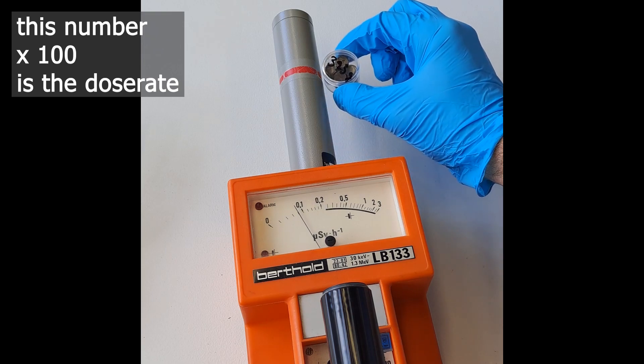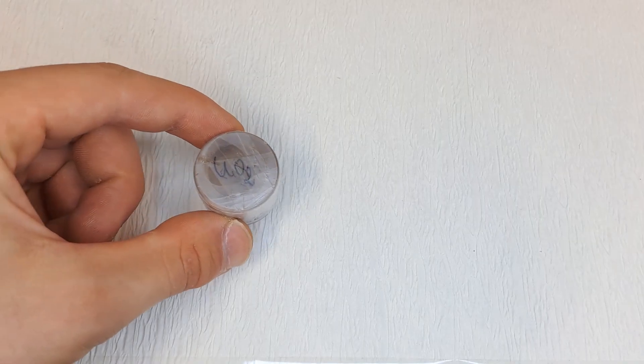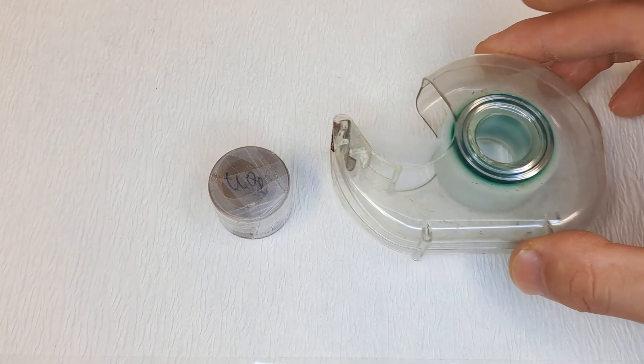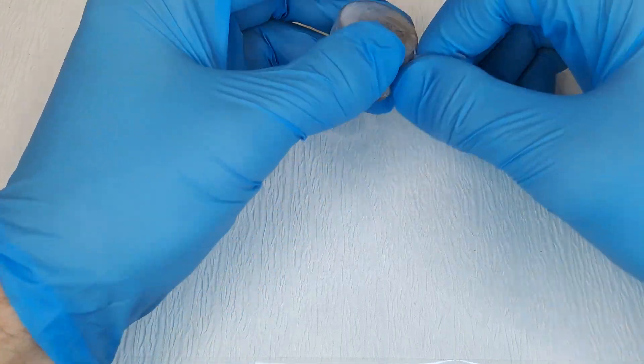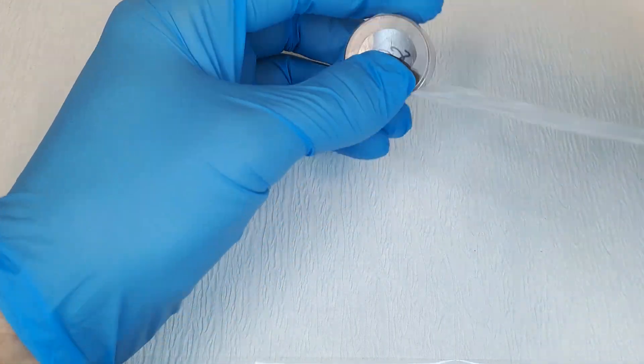Of course, it requires analysis to determine what's actually in it. So I took some uranium dust and carefully fixed it to a strip of adhesive tape. Why? I'm about to take an alpha spectrum of it.